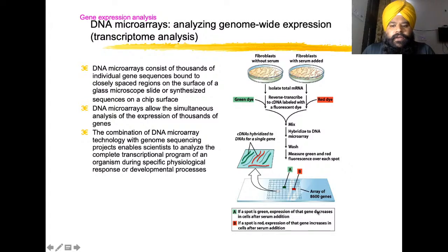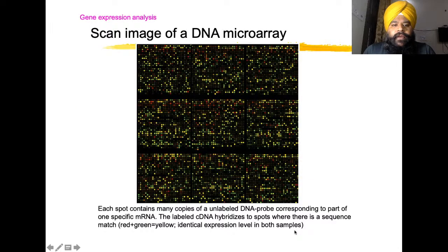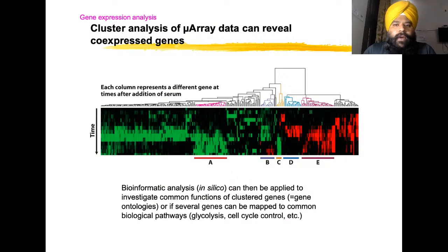If a spot is green, the expression of that gene decreases in cells after serum addition. If the spot is red, the expression of that gene increases in the cells after the serum addition. So in this way, you have your red spot, green spot, yellow spot, and black spot. Each spot contains unlabeled DNA probe corresponding to part of one specific mRNA. Red plus green makes yellow, which is an identical expression level in both your samples that we have used with the red and green. So this way we can have this cluster microarray analysis data. This is bioinformatic analysis data that is in silico, like computational biology, in which it's showing the red genes and green genes together.